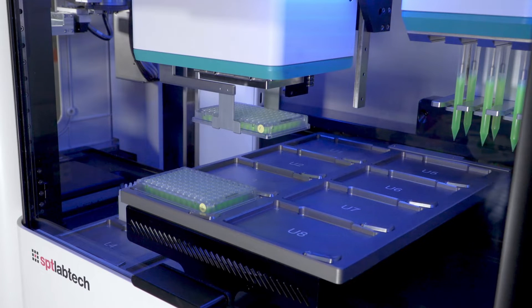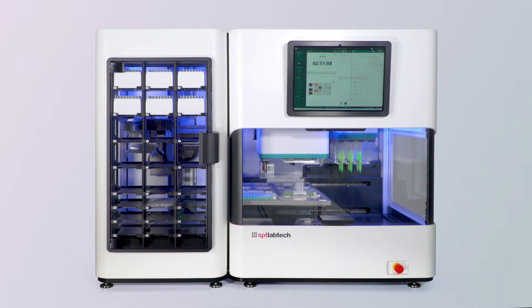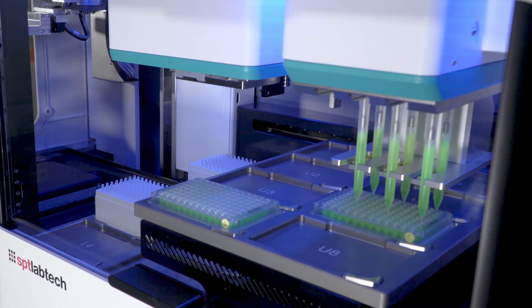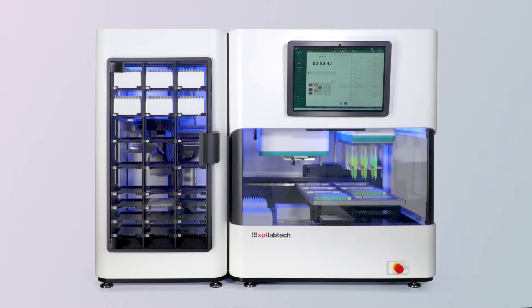You can see the plate was picked and placed into a new deck position. Next, the dispense head with six syringes is going to dispense into every well of the 96-well plate. Because we're using six syringes, the dispense is really fast — in a matter of seconds you have the full plate filled.